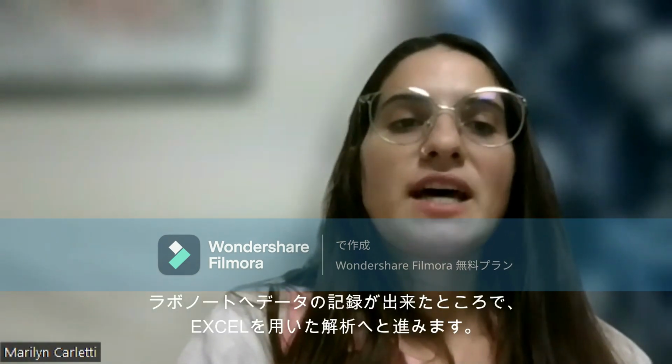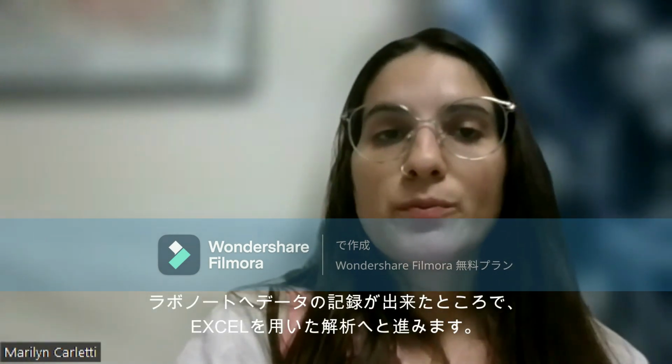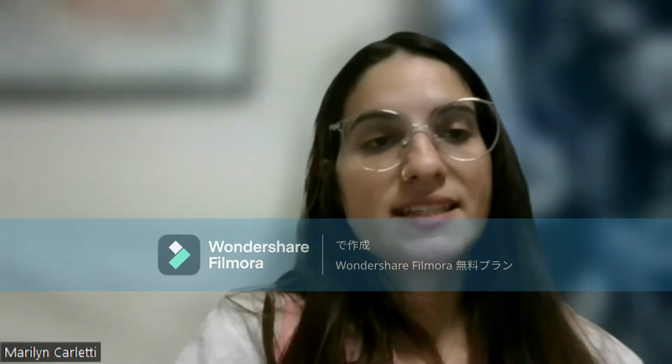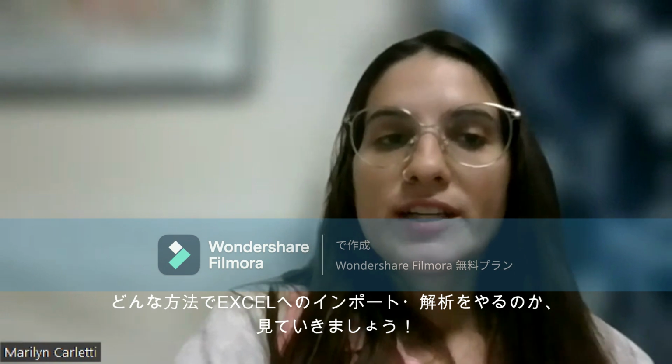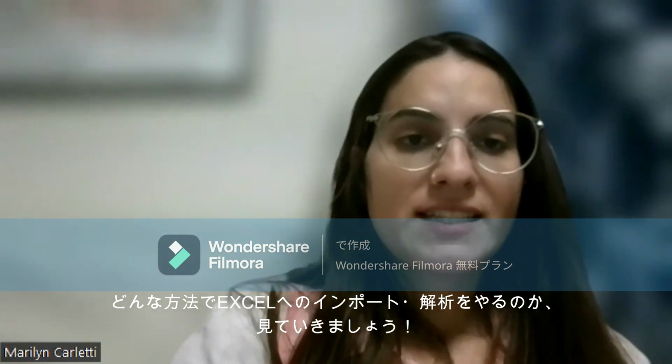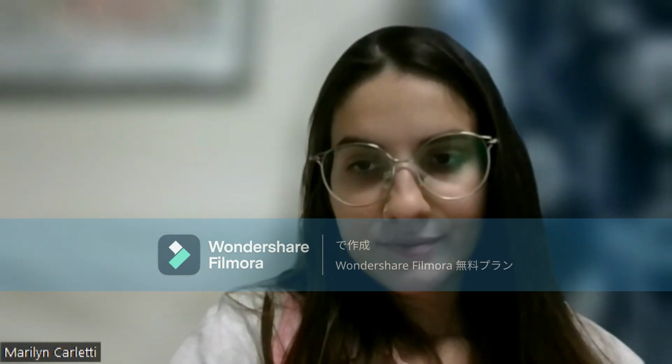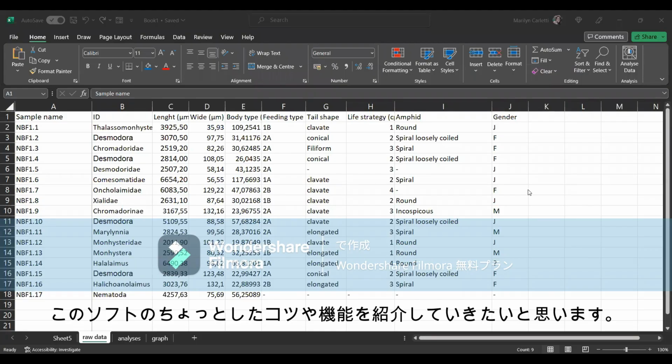So once we have recorded our data in the lab notebook, we have to import it in a data form for further analysis, like in Excel. What is the best way to enter this data in a Microsoft Excel file to make it easier for you to analyze? This is not meant to be a tutorial due to time limitations, but I want to show you a few tricks and features of this software.